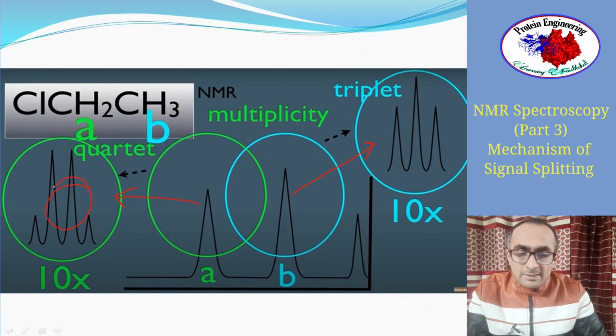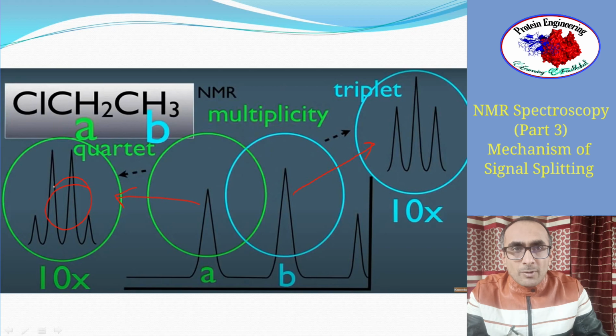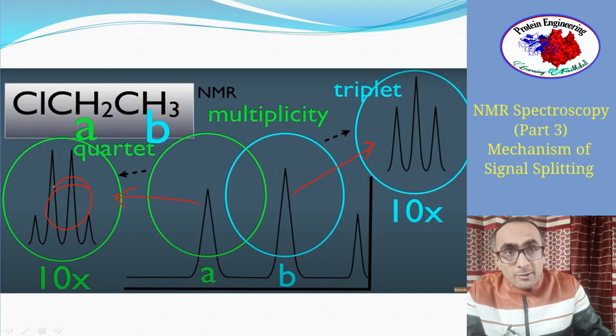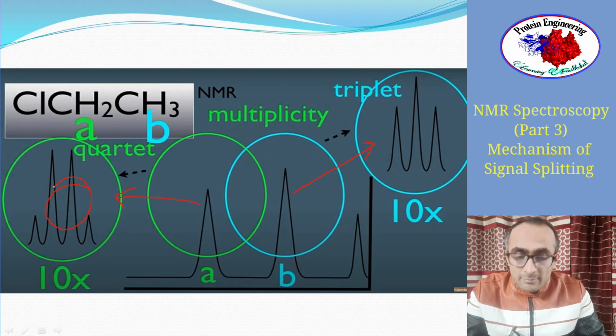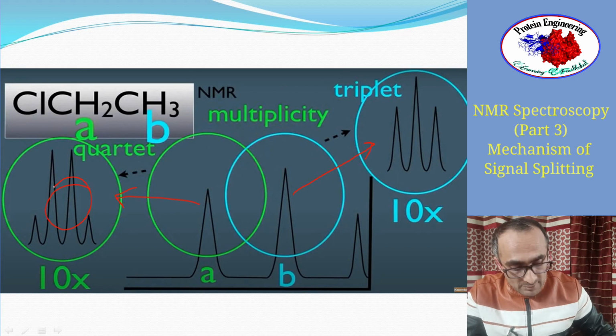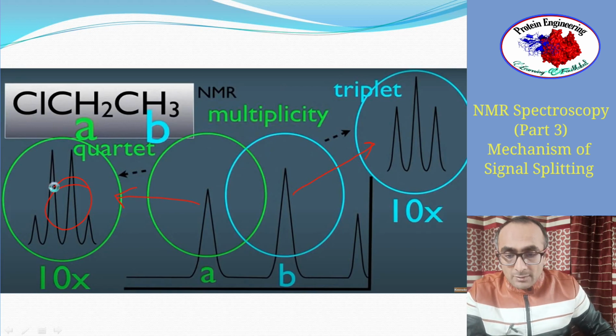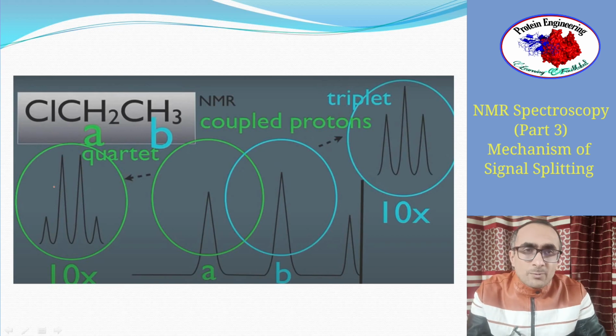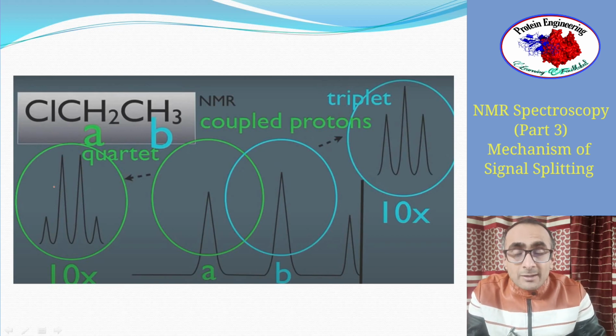This splitting gives valuable information about the number of neighboring protons attached to the carbon atom which is linked to the hydrogen atom giving the peak in question. We know that protons have a magnetic field because they are charged and also moving in a molecule.